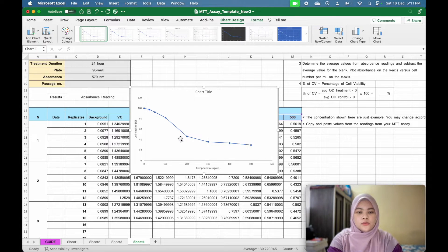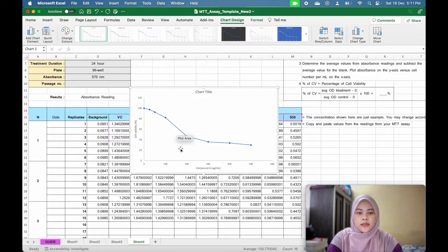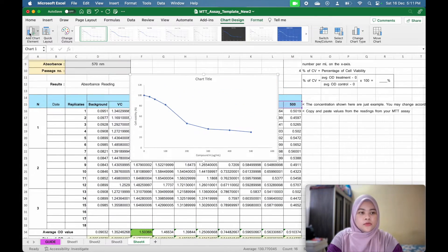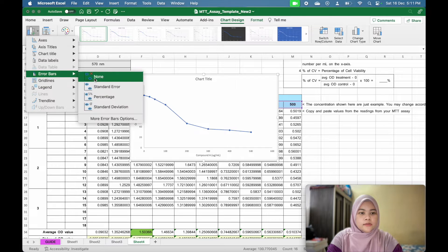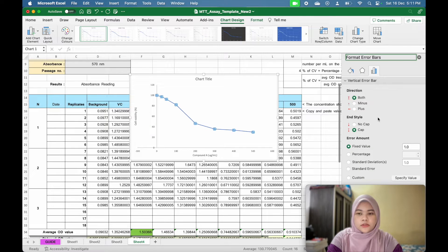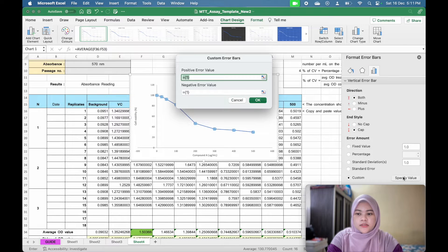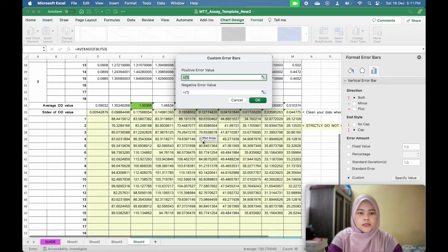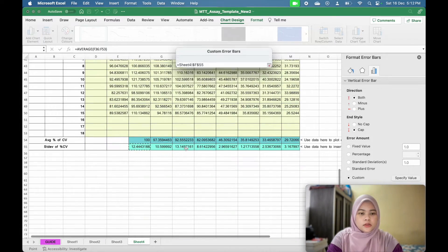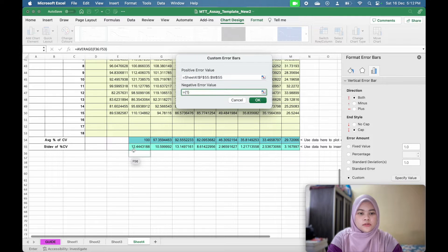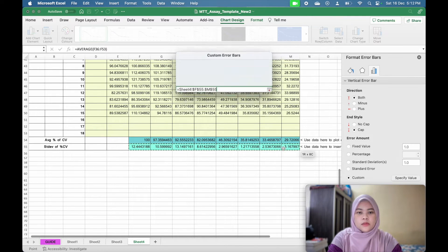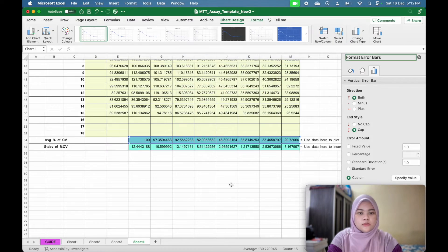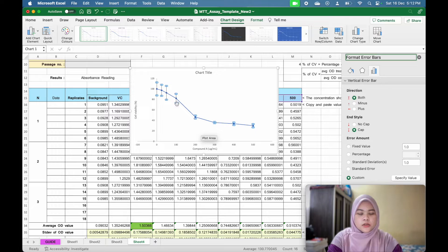And I can also put in the error bar. To put in error bar, you go to add chart element and error bar and more error bar option. I will put in custom and specify value for positive and negative area will be the same value. You can just select the standard deviation. The standard deviation is quite large. The error bar will be quite large. So maybe before that you can clean your data so that your error bar is much smaller.